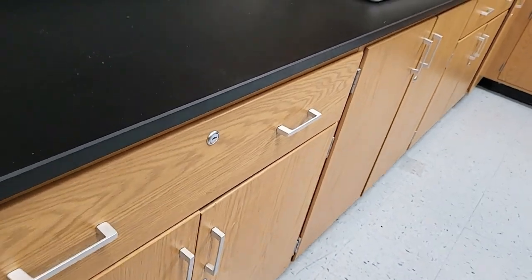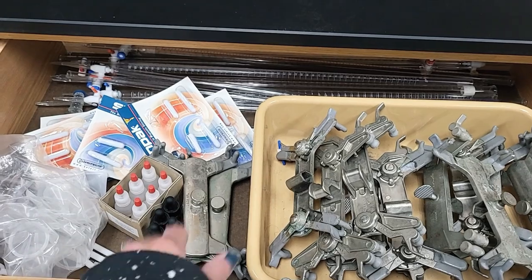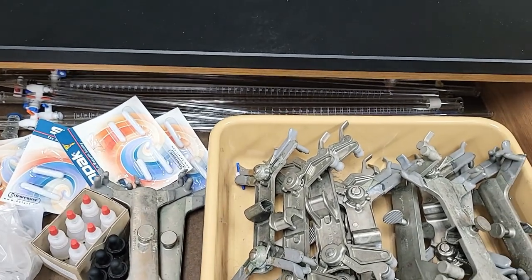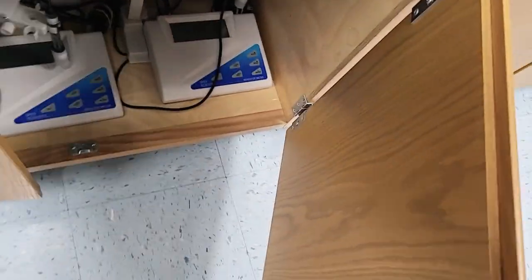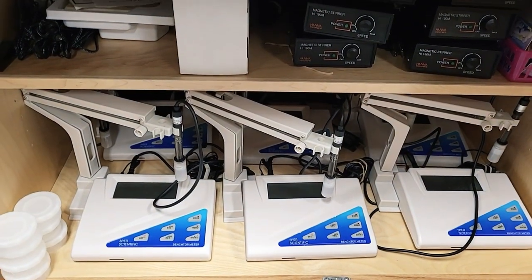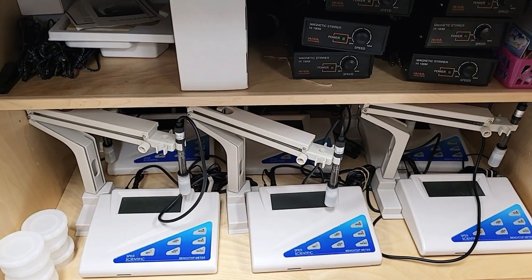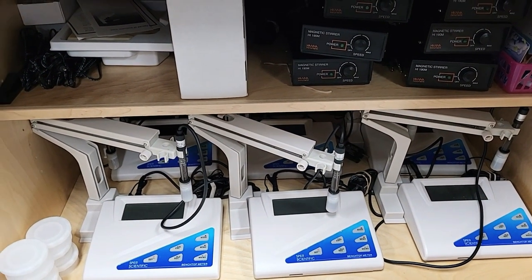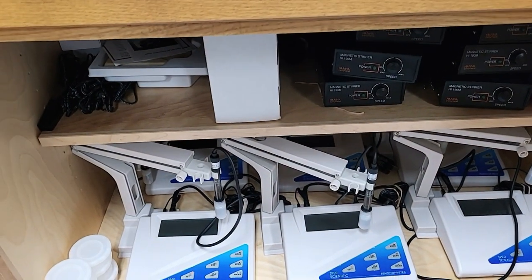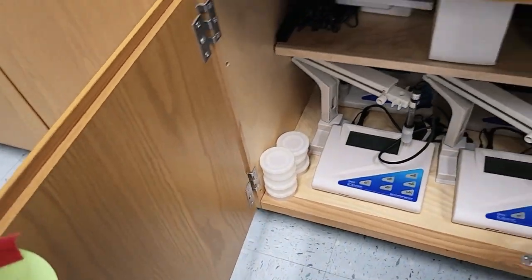And then here's my titration stuff. So I've got a lot of titration stuff. I've got my burette clamps, funnels, and then in here I've got my pH meter. So this is typically for AP only. I don't really do this with honors or CP, but this is all the stuff. This hasn't changed. This is what it was before. I'm actually going to take this off because this was here earlier.